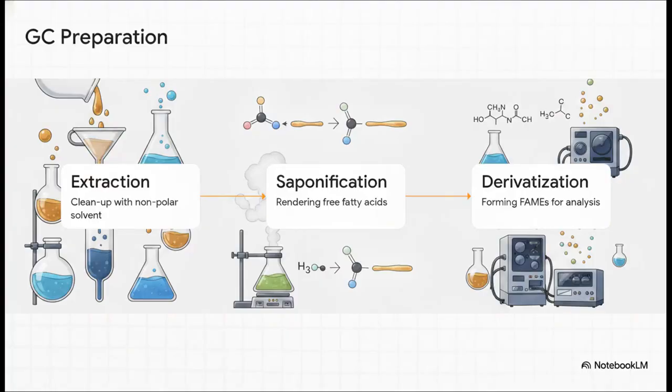To measure those specific health-impacting components hiding inside our lipid extract, we turn to the gold standard of modern food safety analysis, gas chromatography. But here's the catch. We can't just pour our fat directly into a high-tech machine. It requires a rigorous three-step chemical preparation.